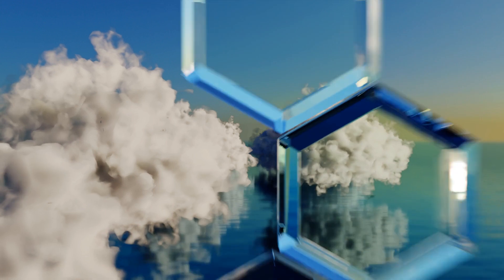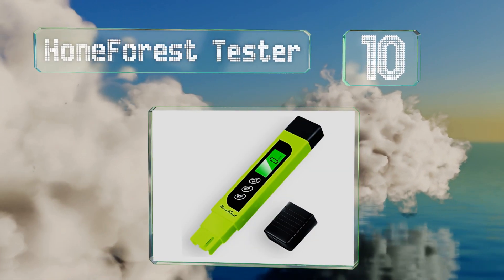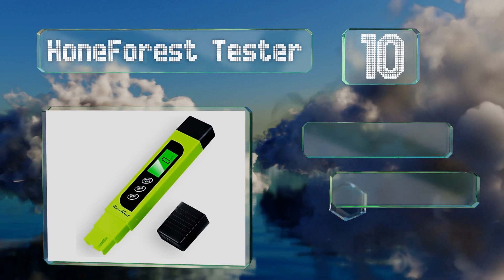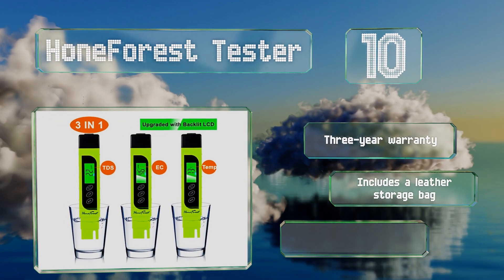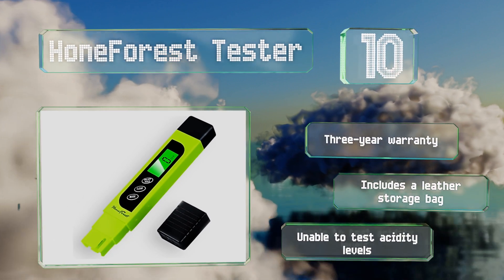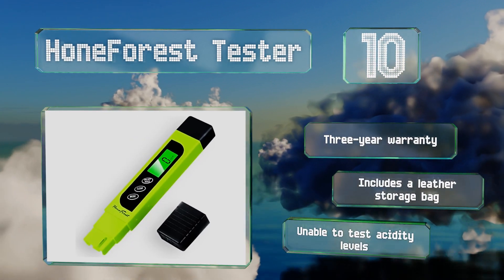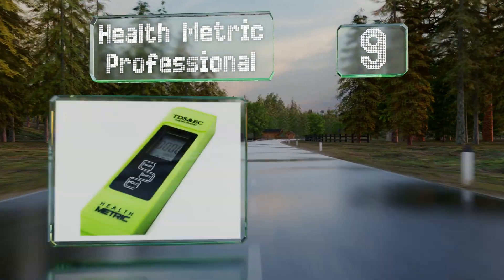Starting off our list at number 10, you can determine the purity of a home's drinking water supply using the HoneForest Tester. Its backlit LCD flashes either red or green depending on the readings obtained, while a convenient auto-lock function makes it easy to hold the measurements for recording. It comes with a leather storage bag backed by a three-year warranty, however it can't test acidity levels.